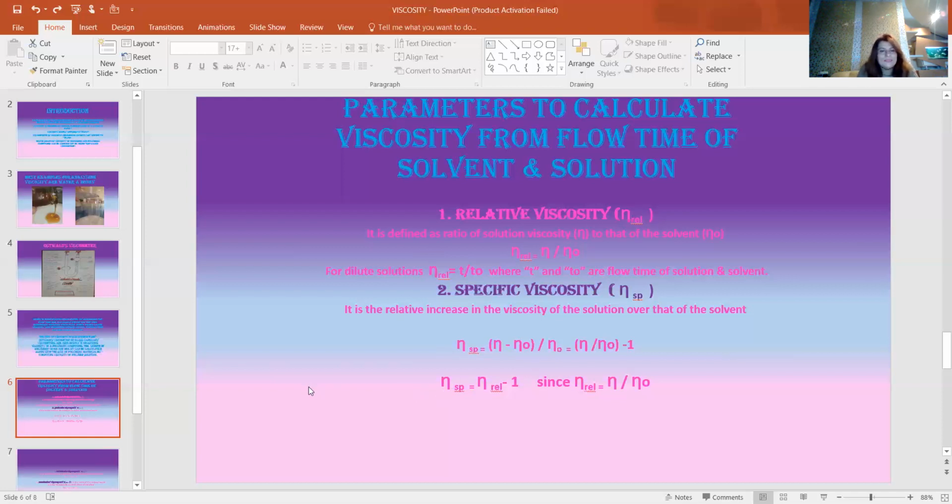Okay. Well, viscosity is tough, but it's very interesting also, and I just love this topic. So I thought that I must share it with my students, whoever is interested in calculating viscosity nowadays, whoever is using viscometers or Ostwald's viscometer. They would find this video helpful, and these calculations or formulas would be helpful to them if they are performing dilute solution viscosity measurements.